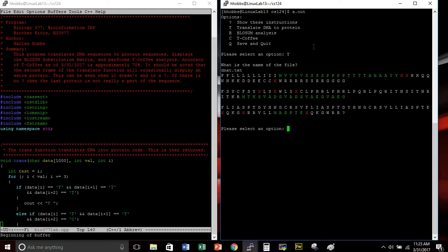You can see three different frames. You'll notice that there's a lot of the same letters in here. That's specifically because I wanted to make sure every single possible codon was being coded properly, so I just went down all 64 of them and wrote them in. That's why you see a lot of duplication. This top one is the first frame of reference, then second, and then third, starting with the first, second, and third DNA nucleotide respectively.